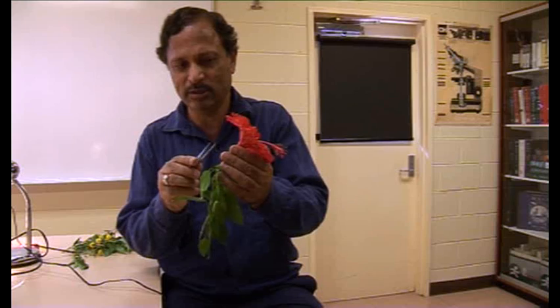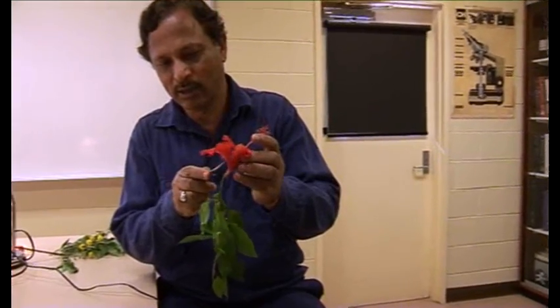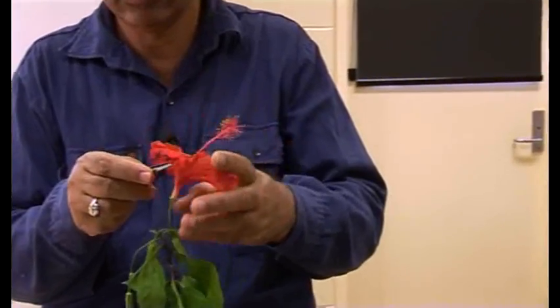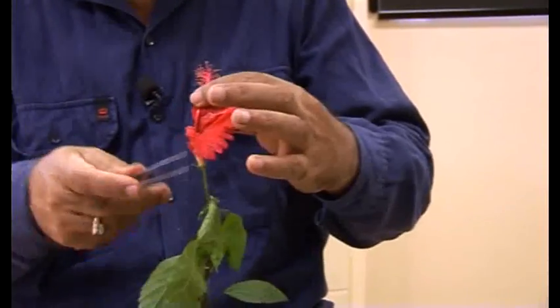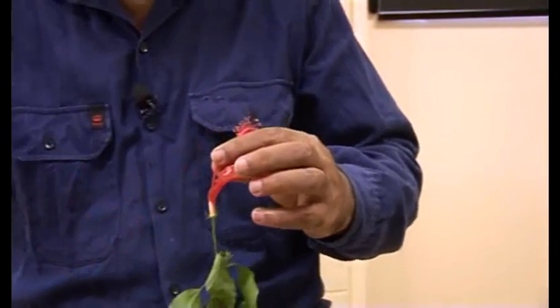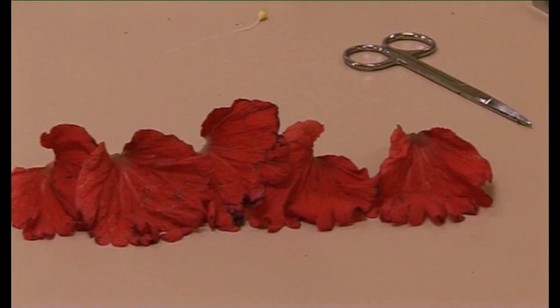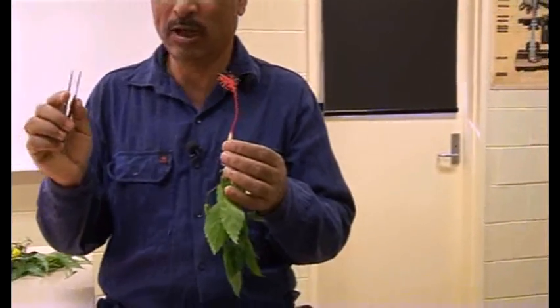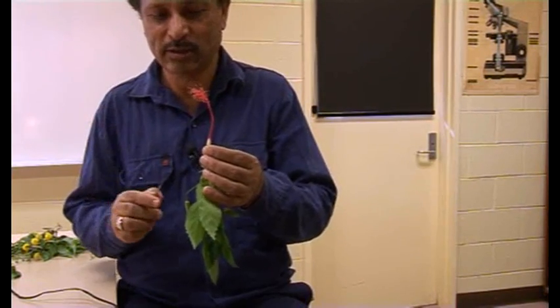The next step is to do the same thing with the petals — pull one at a time: one, two, three, four, and five. So you've got P equals five. Usually the petals and the sepals either equal or double the number of the sepals — it varies from taxa to taxa.